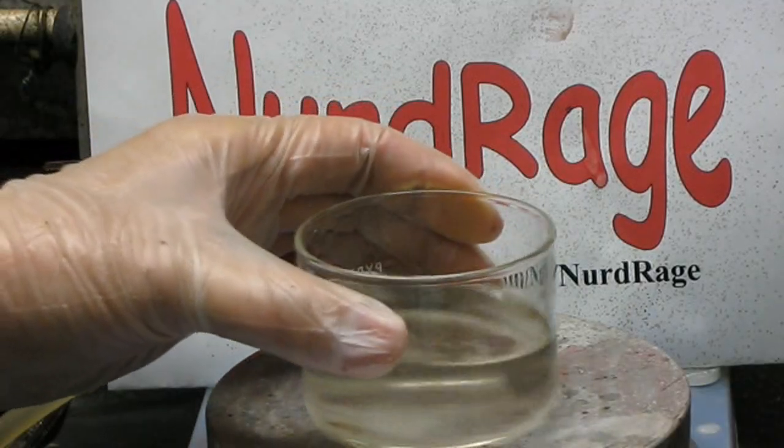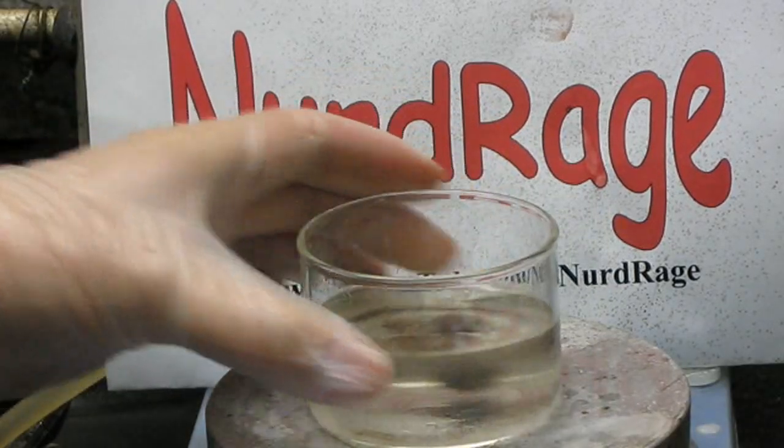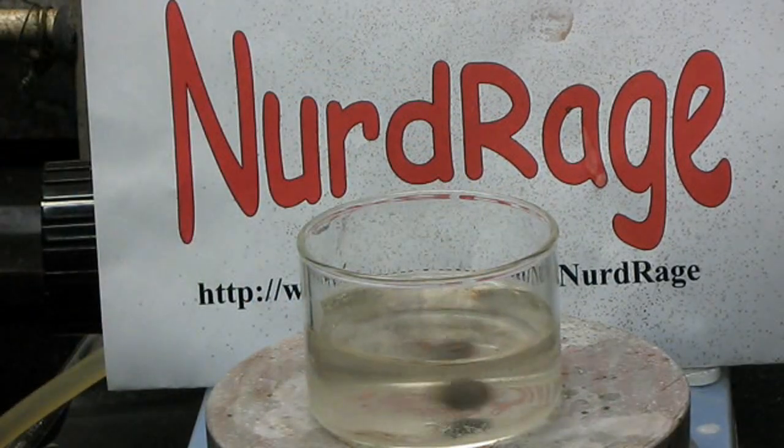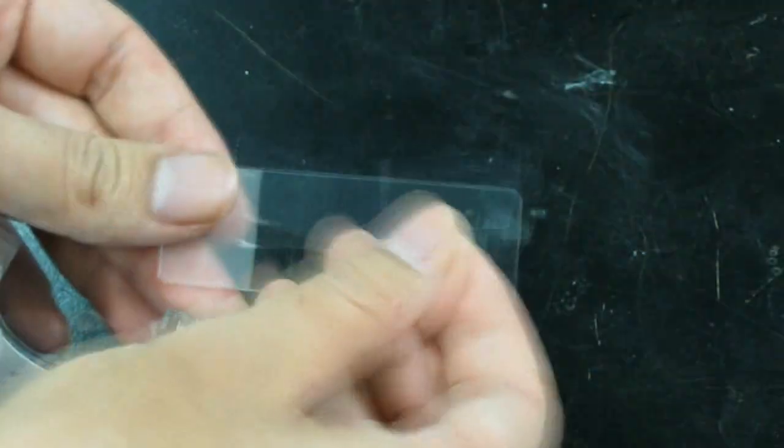Now the solution is ready to create a silver mirror, but it will proceed very slowly while it's still cold. This gives us time to prepare our mirror surface. In this case we'll be using a microscope slide. Since we only want to put silver on one side, we've covered the other side with tape to protect it.